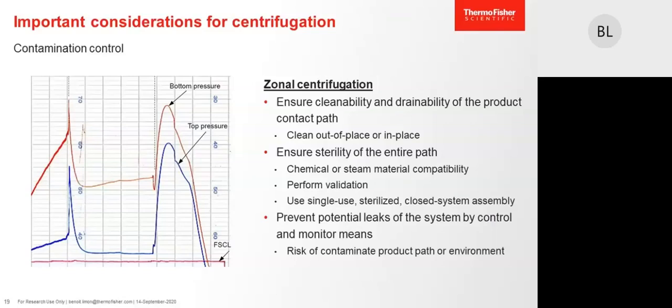And the other method to prevent contaminants is to prevent potential leaks on the continuous flow system.